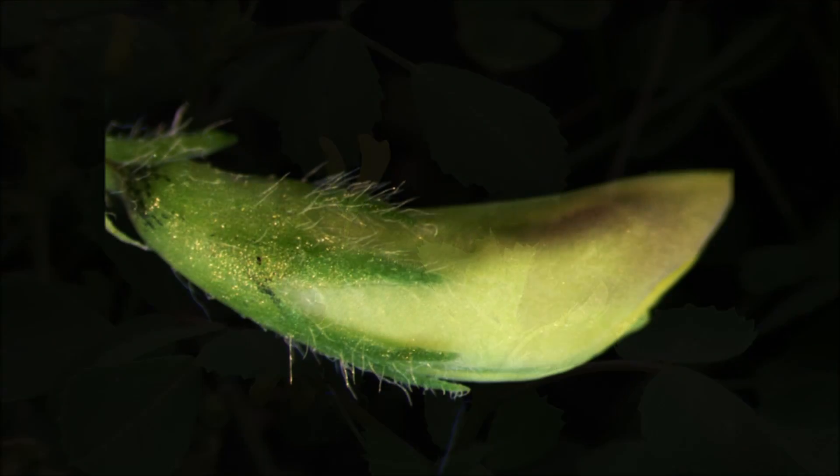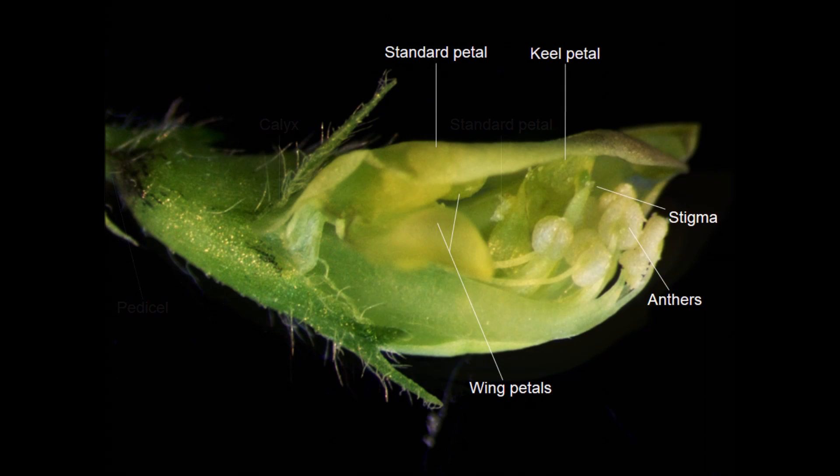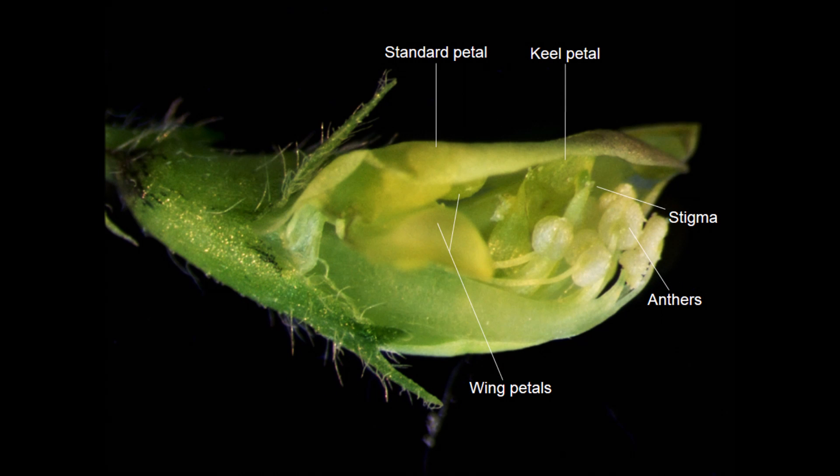What you are seeing here is an unopened R108 flower bud showing the external flower structures. The pedicel is at the base of the flower on the left in the image, which holds the flower. You can also see a lobed green calyx and a large standard petal which covers the internal floral organs. To visualize the internal floral organs, here you can see a dissected flower. The standard petal is outside of the flower; underneath the standard petal are two small wing petals. You can also see a fused, relatively large keel petal which covers both the female organ — the stigma — and the male organs — the anthers.